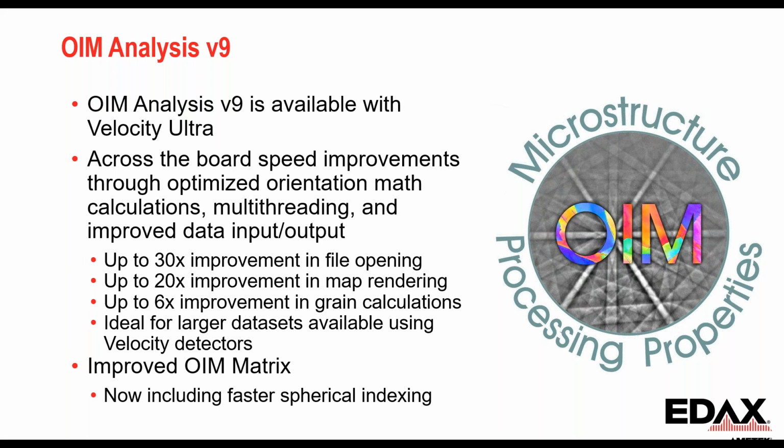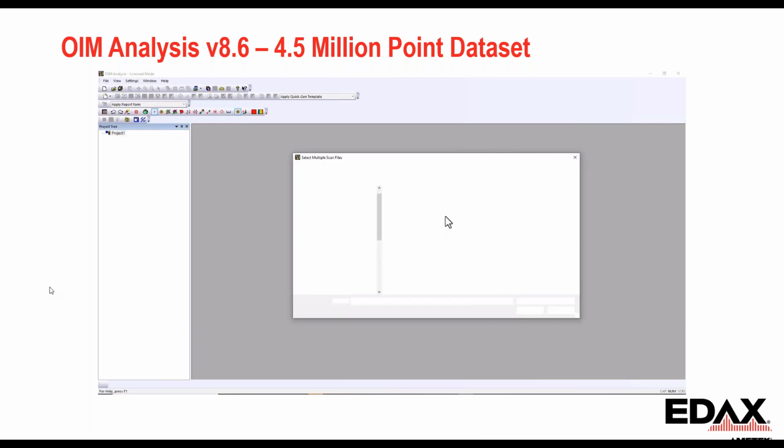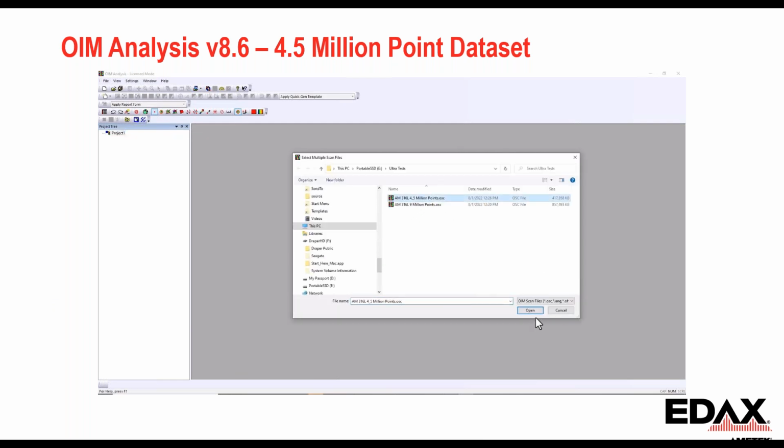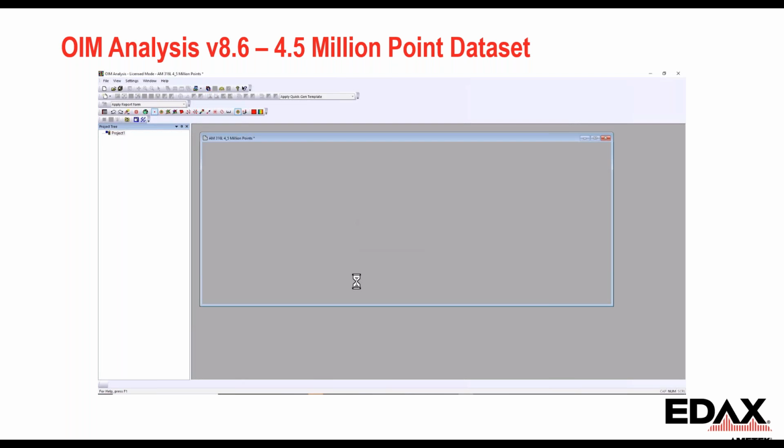So before I turn it over to Will, I just want to show, here's a little movie. This is with the current version of software, 8.6. I'm going to open about a 4.5 million point data set. And you'll see here it starts to work, and it's going to take a little bit of time to get this all into memory. And what I want to just show you and try to entertain you for the seconds it's going to take as it loads is, for this data set, it was traditionally a large data set. It takes a minute to get it loaded. It's going to take a minute to create a map.